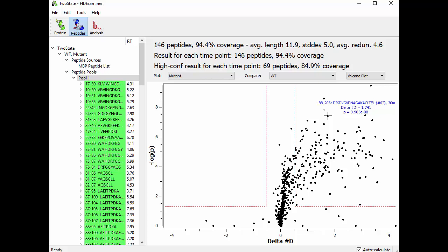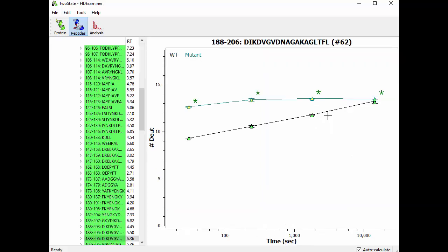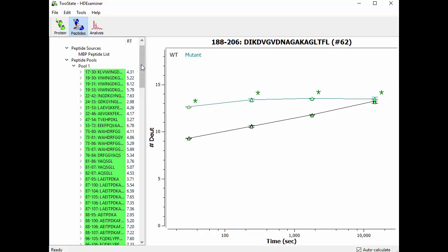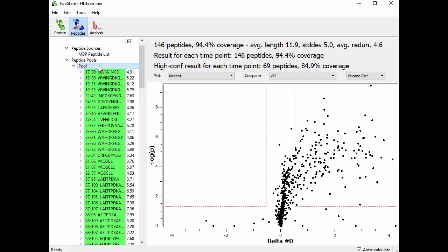Each of these points on the Volcano Plot represents one peptide at one time point. So for example, this point here that I'm mousing over is peptide 188206 at the 30 minute time point. And in fact, if I click on that, it takes me to its uptake plot as well. So that's a handy little feature.